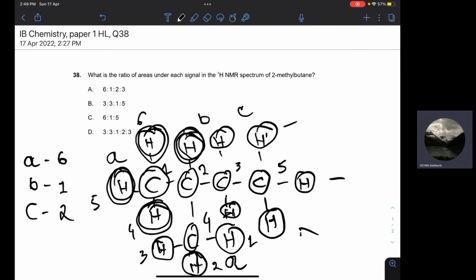They're attached to a carbon, and that carbon is attached to another carbon which has 2 other hydrogens attached to it. So it's not in the same neighborhood. If you look at the location, it's not the same at all, right? So these are in a totally different environment by themselves. So you can consider this as environment number D. We have a new environment, and D has 3 hydrogens in it.